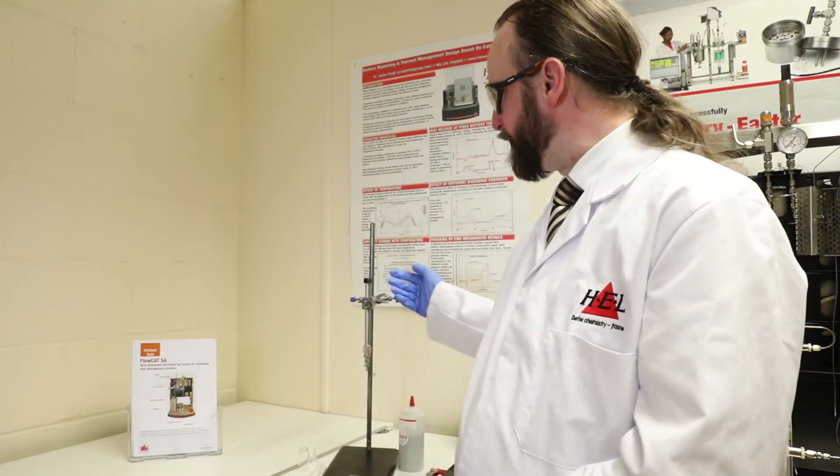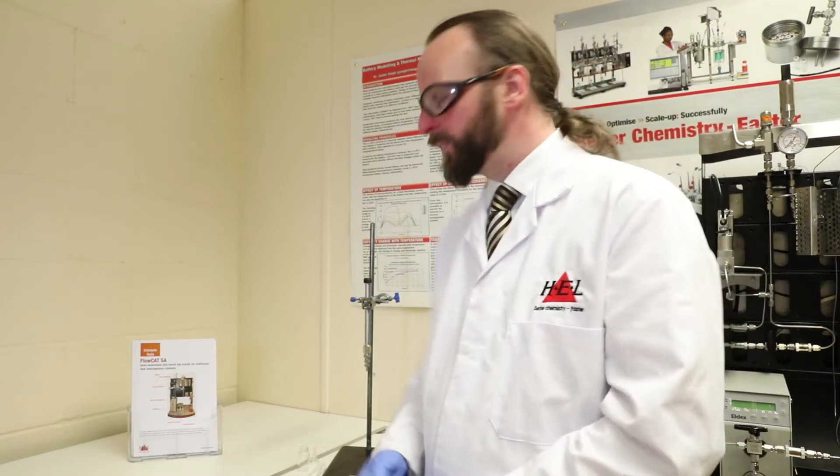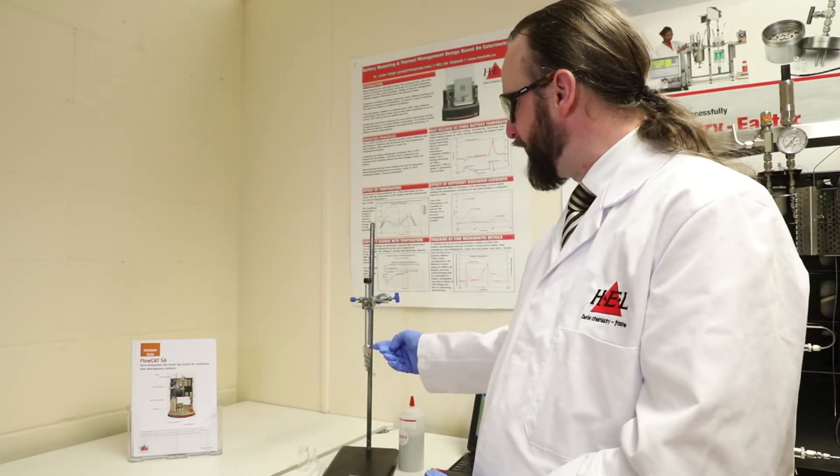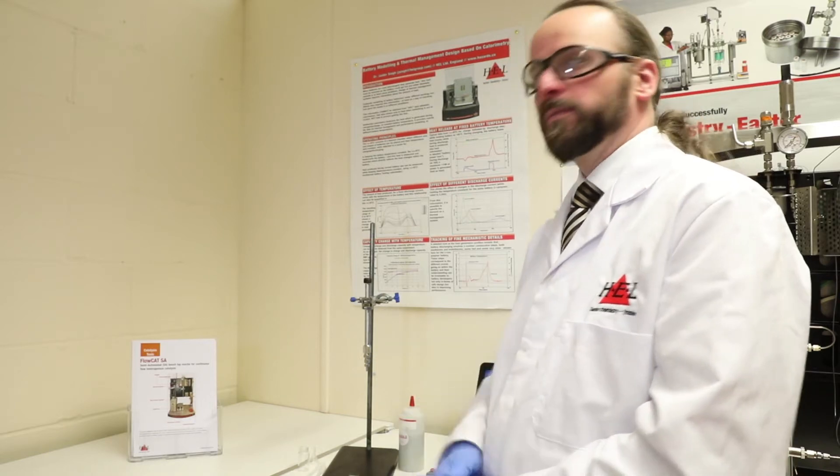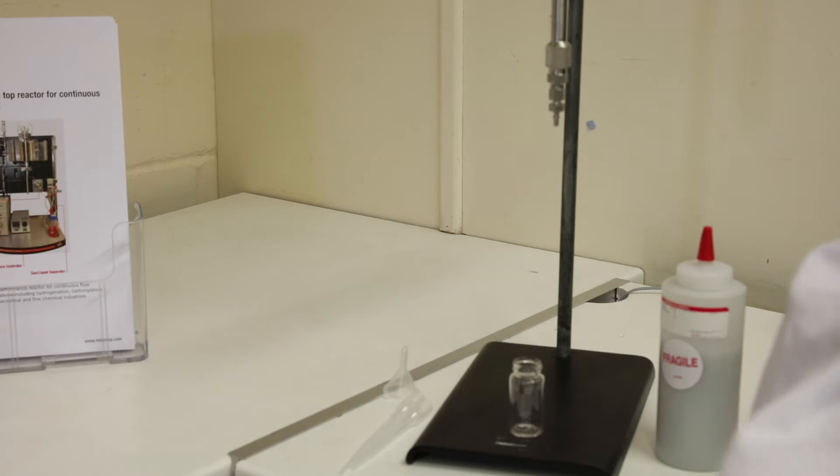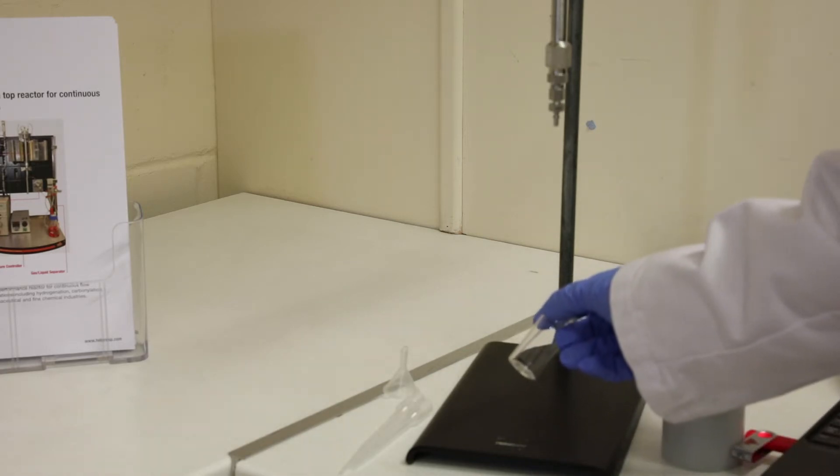So this is our fixed bed reactor from the Flowcat. This reactor is a six inch long stainless steel pipe with a frit at the bottom to retain the solid in the reactor. We have this glass vial here where I've just put a little mark on it to show the volume that is in the reactor.